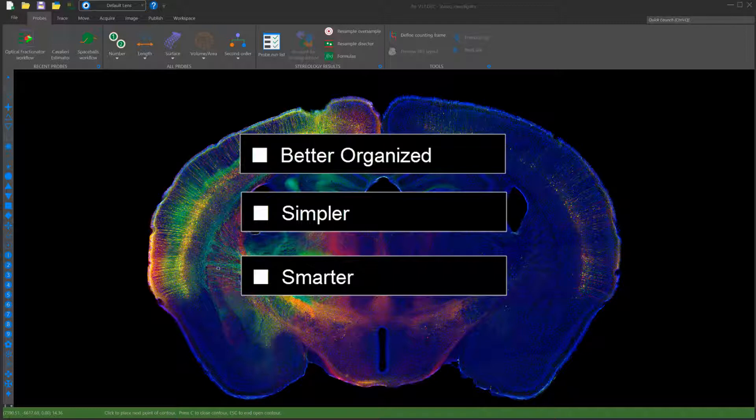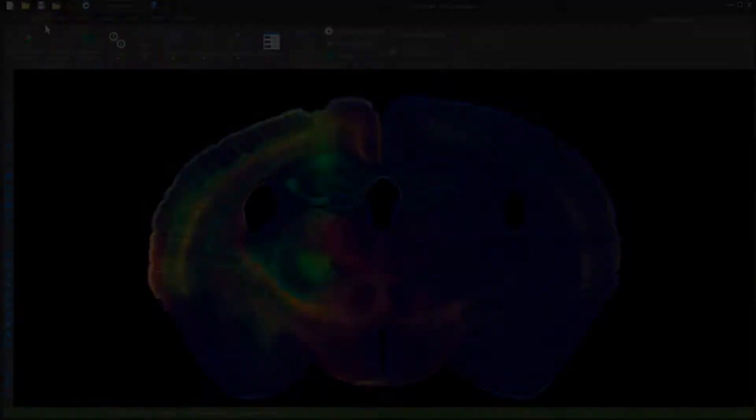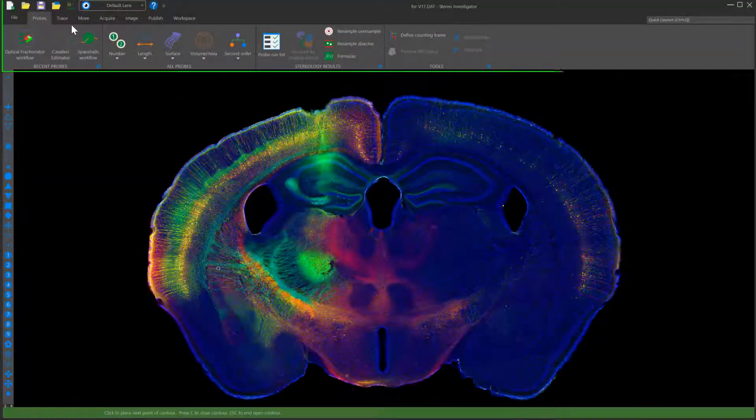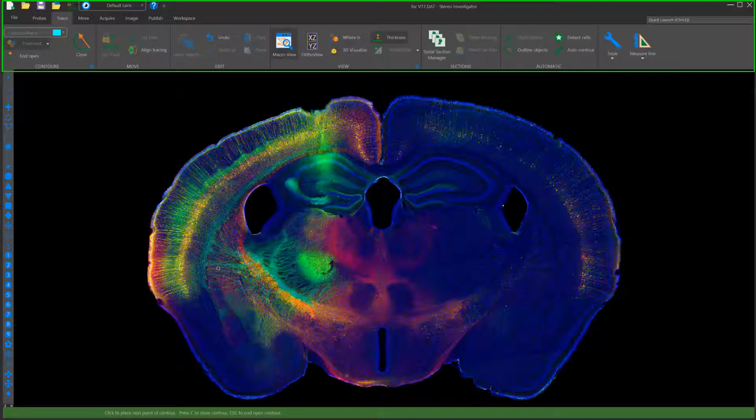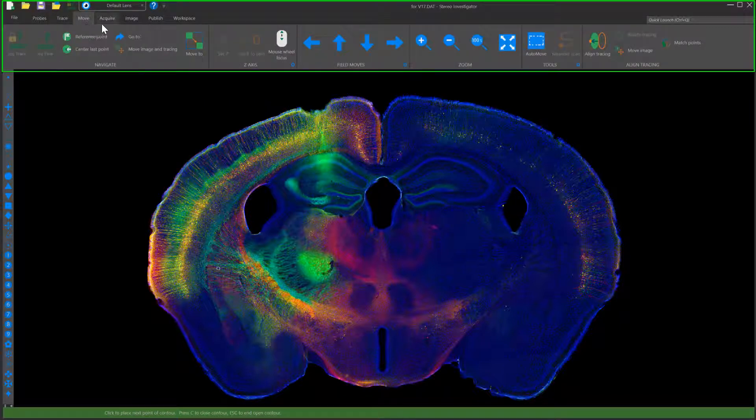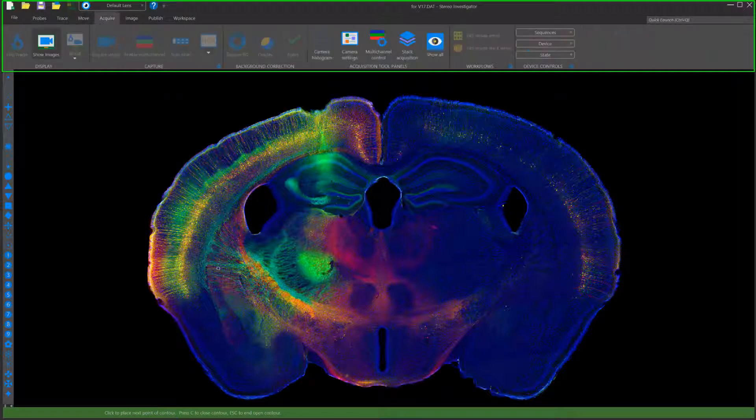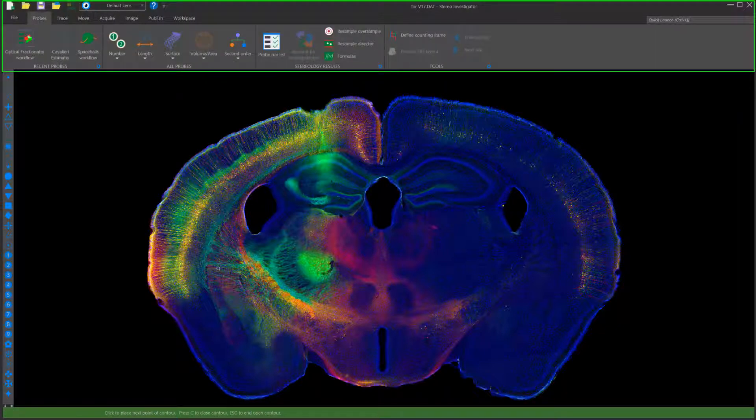Let's take a deeper look at the updates. The updated StereoInvestigator experience has a new ribbon bar design that is task-oriented. All tools are easier to access, and the most commonly used features, such as probes, are very visible.